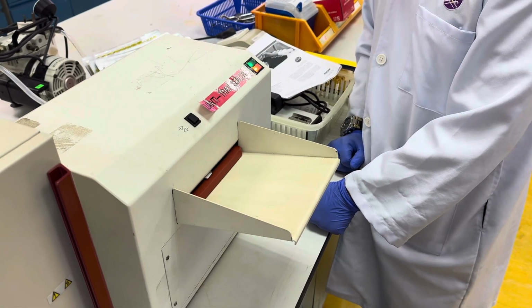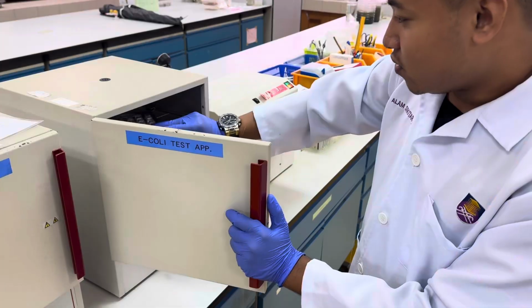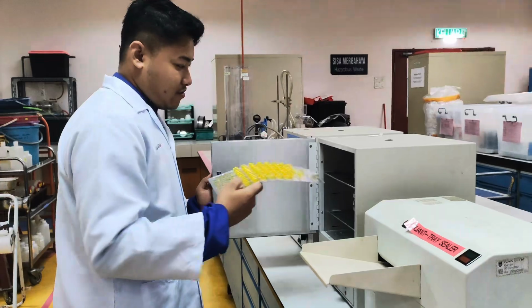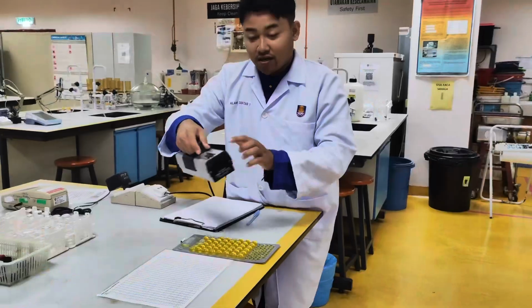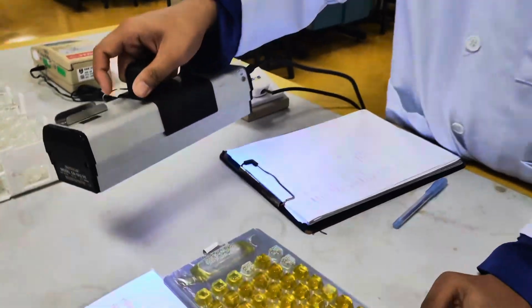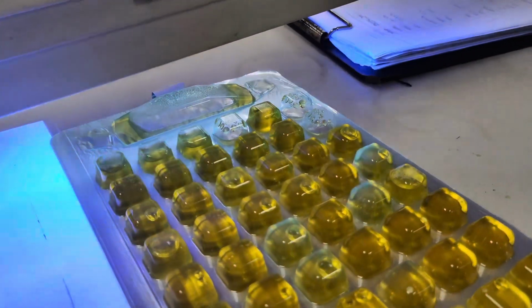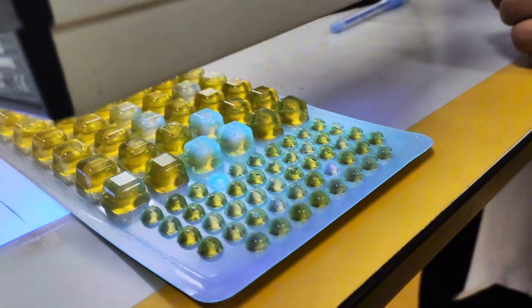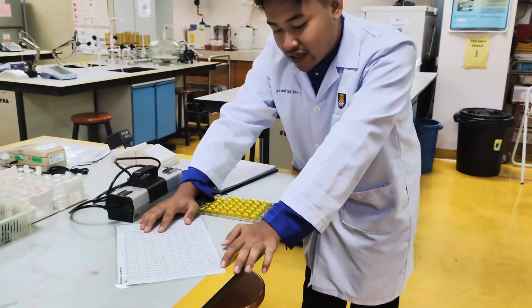After sealing the quanti-tray, place the quanti-tray into the incubator for 24 hours. Next, after 24 hours, the quanti-tray is scanned using a fluorescent light. As you can see, the neon color indicates the availability of the E. coli.